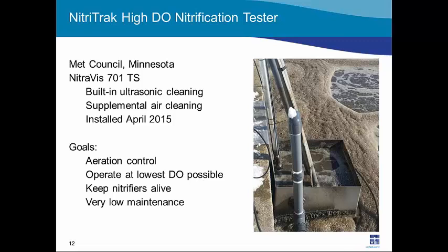Makes sense. However, they still have nitrification limits year-round, and sometimes of the year those ammonia limits are lower than others. So they need to keep their nitrifiers alive and active. So when they need them, they can put them right back into service.